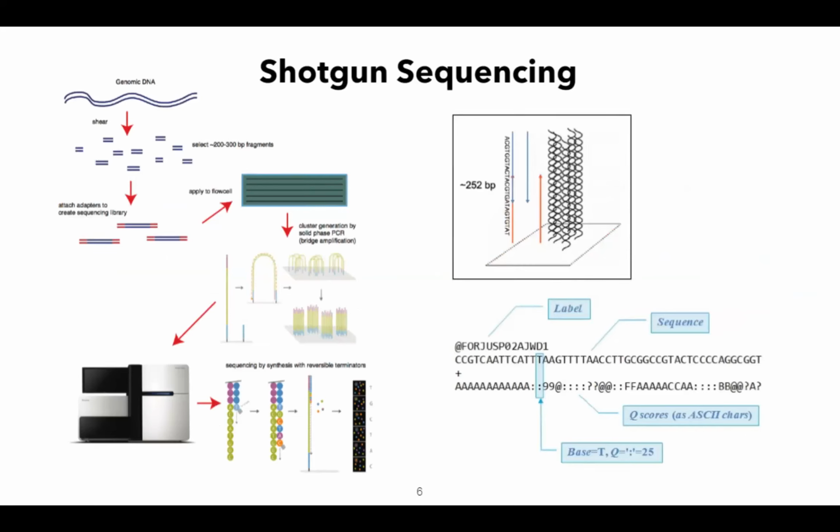This is the process by which sequencing generates the reads, and these reads are short, so they are amplified using PCR. Then we use adapters of a specific kind, and these are used to identify the beginning and the end of the short read, and that is how we get our raw data. We clean that data to get a good quality FASTQ file. That's the whole thing: how exactly you get the reads and how you obtain the FASTQ files.